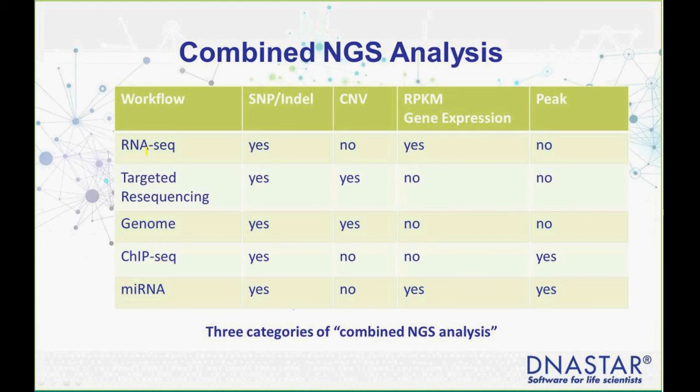And a third type is combining assemblies from different types of workflows. For example, RNA-Seq and ChIP-Seq. It might be the same biological sample, but a different sequencing run, because you have different sequencing technologies and preps that generate the RNA-Seq and ChIP-Seq data. But I want to co-analyze them together. I want to relate my bound protein, maybe a transcription factor, to changes in gene expression. We've streamlined that as well, so we can load RNA-Seq projects together with ChIP-Seq, and then in the end get an easy-to-use interface for comparing the 2. So there are 3 different ways that we can combine. It's all new to version 14. And I can show you now in the software how the interface has changed to accommodate this.